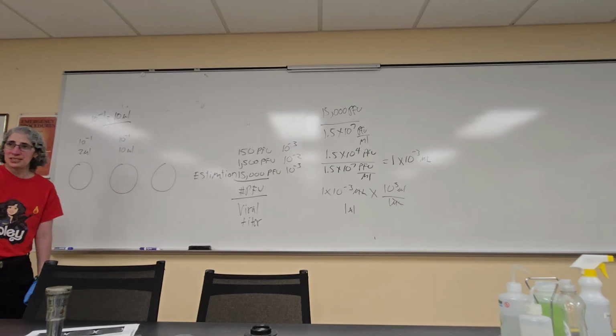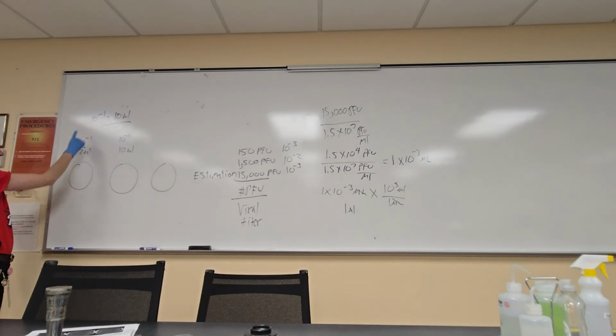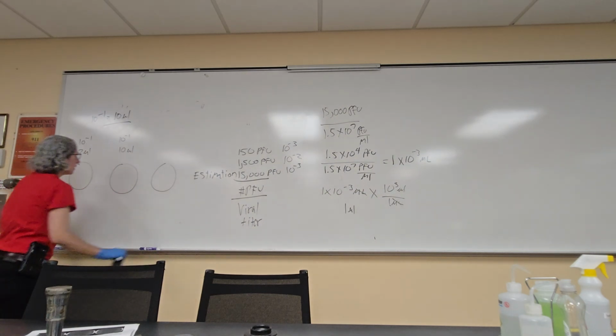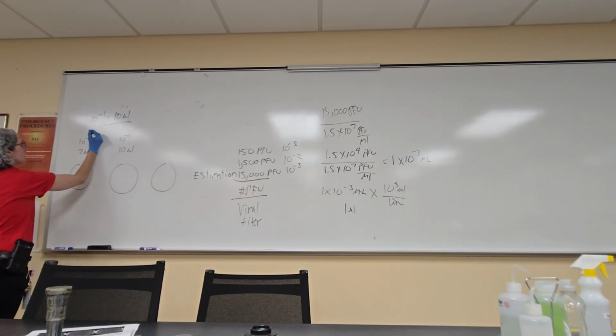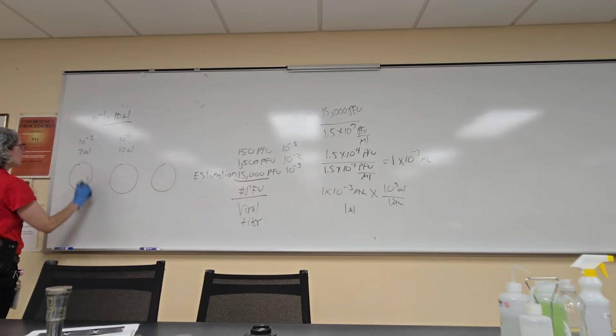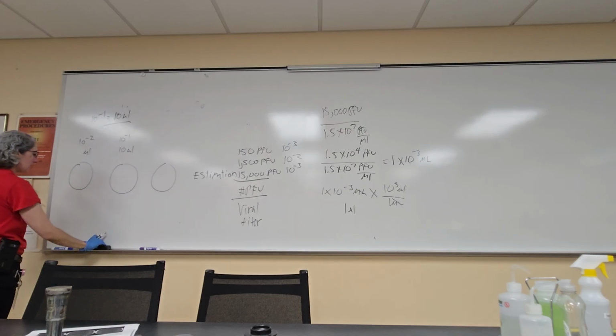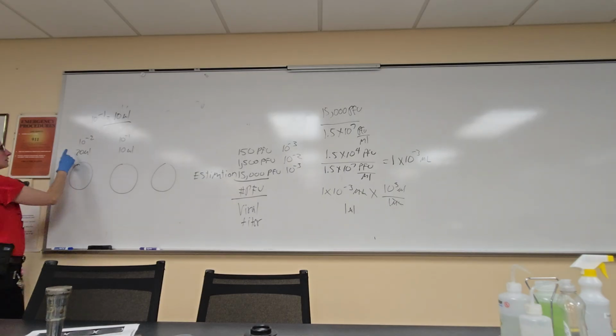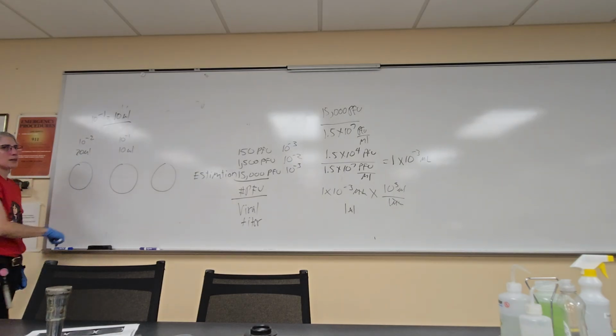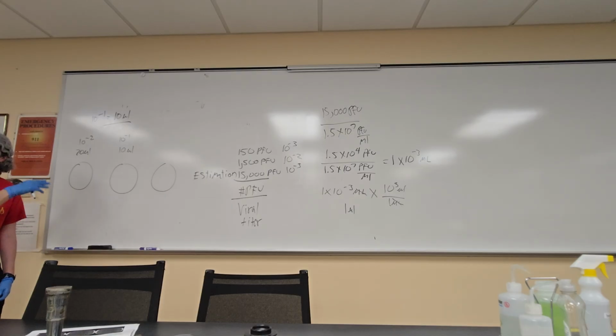Yeah. All right, so in this situation, instead of using a 10 to the minus 1 dilution, we're going to make that a 10 to the minus 2 dilution, so that we can use 10 times more, and that becomes 20 microliters. I lied, 5 times less. Yeah, that's fine, because we're doing 5 times less volume on this plate. But it's a 10, yeah. All right, 5 times less.